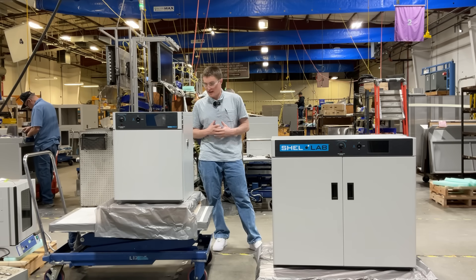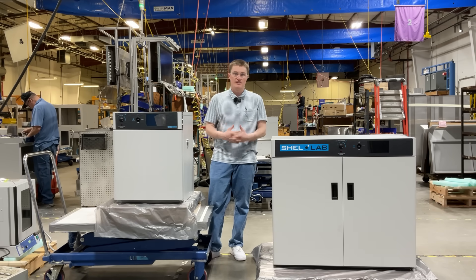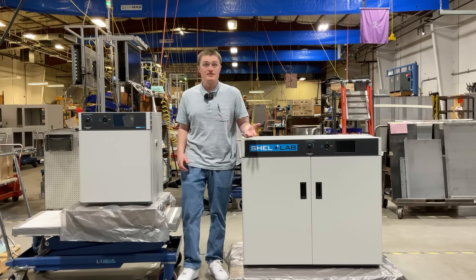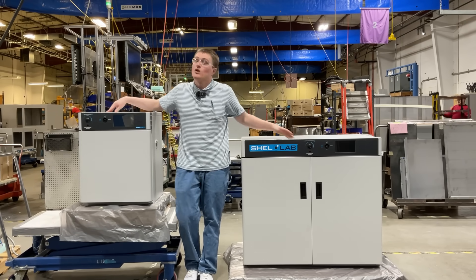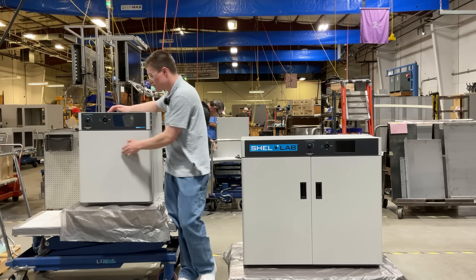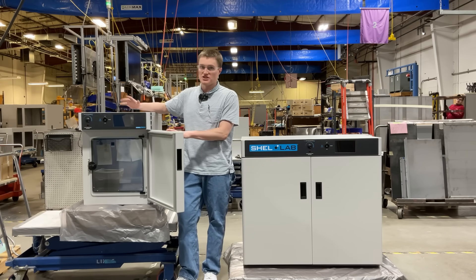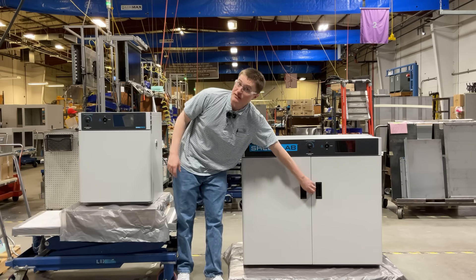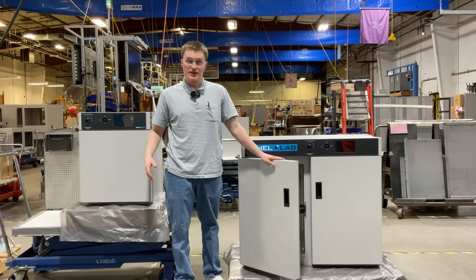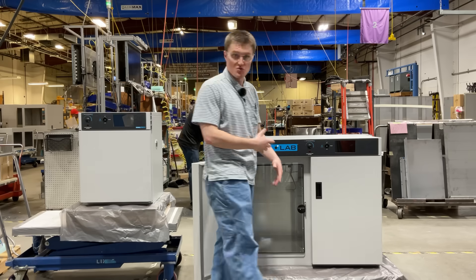These products are designed to provide uniform and stable temperature, ensuring optimal growth conditions for cultures, bacteria, and other biological applications. Let's take a look at the inside of both units. The SMI-2 features a two cubic foot chamber, which makes it ideal for compact benchtop applications. The SMI-11 features an 11 cubic foot interior and six shelves compared to two, to allow you to fit a larger volume of samples within.